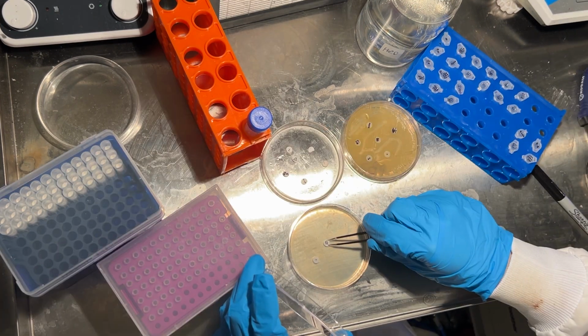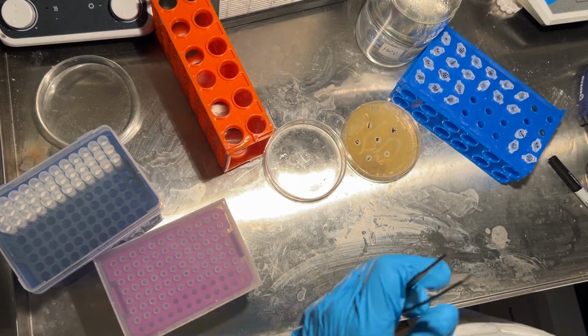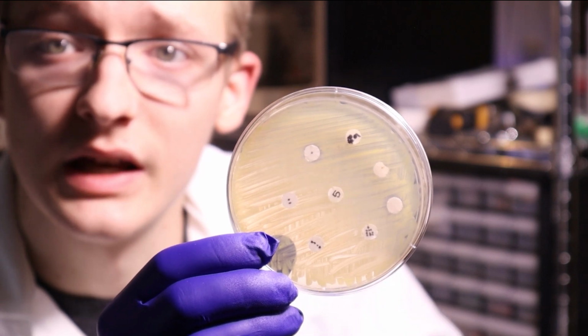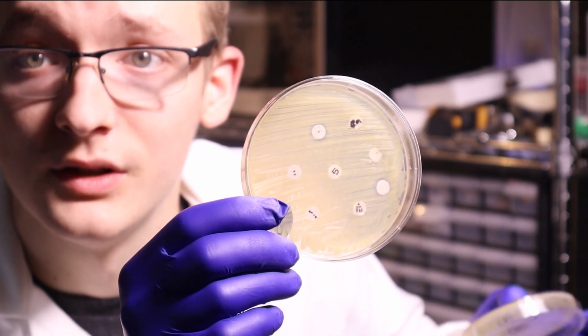adding the discs, and a day later finally got the answer I had been seeking. I had inhibition zones formed around the discs in the shape of a smiley face. Unfortunately, I had made the lawn too thick on the actual disc diffusion assay, so only the most concentrated one had any inhibition zones, and it was barely visible.